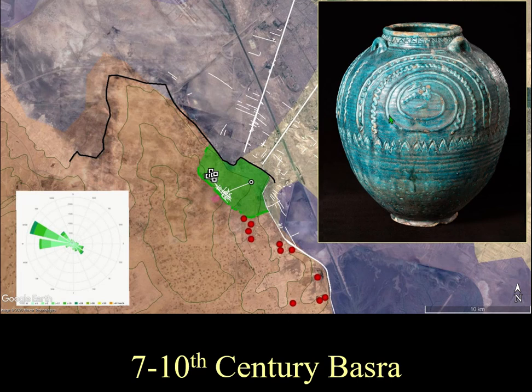fabric indistinguishable, shall we say, from the fabric found in the lusterwares and the blue painted wares, but a bunch of other fabrics which were slightly different, sufficiently different that I can say this is different. I don't know how different, I don't know why different, but it's different. Not as different as the other major production centers, attributed to, say, Kufa, not as different as some of those other pre-Islamic sites I've done from not very far away, but sufficiently different.